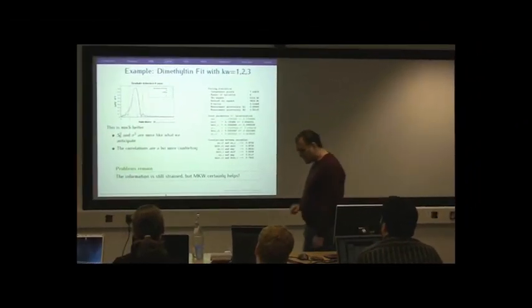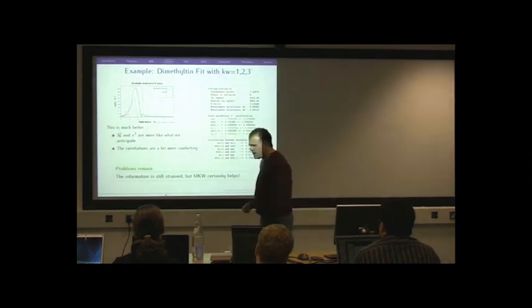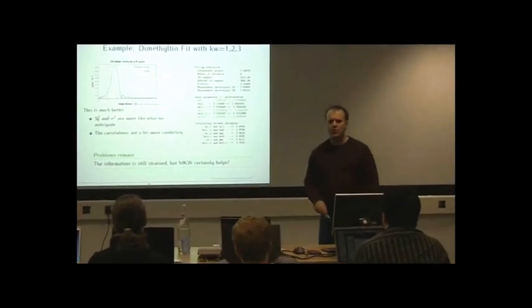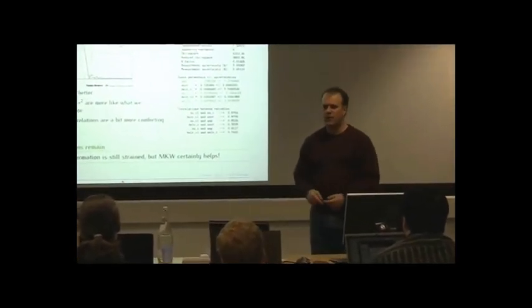So it used to be that in the old version of Artemis, the default was to do some kind of single k-weight fit, and now the default is to always do a multiple k-weight fit.